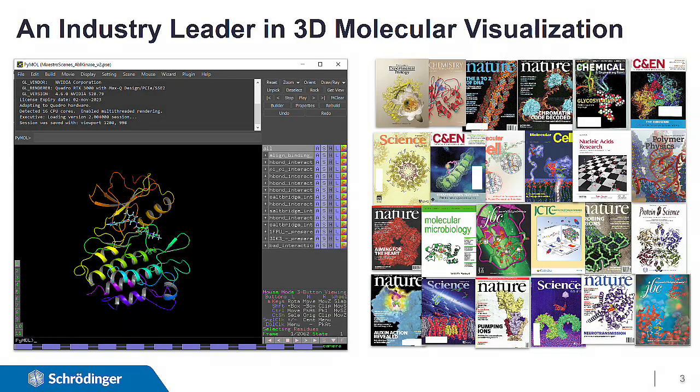Now, at the time, as well as today, PyMOL is best known as a powerful and popular software tool for visualizing and analyzing molecular structures. It's widely used in the field of structural biology and biochemistry to explore and understand three-dimensional structures of proteins, nucleic acids, and other molecules.